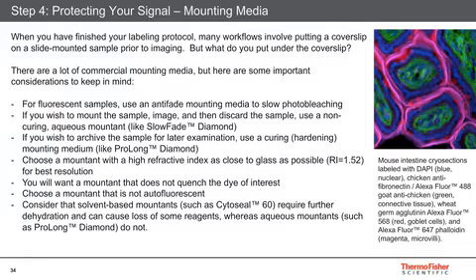When you expose your dyes to a very intense light on the microscope, photobleaching will occur. This is where the dye becomes dimmer as you're looking at it. That's because the strong light is degrading the actual structure of that dye, causing it to not fluoresce as well. An antifade mounting medium has antifade components in it that slow that photobleaching. If you want to mount, image, and then discard your slide, then you want a mountant that has a good refractive index right away, like our SlowFade Diamond and SlowFade Gold products. They don't firm up, they just stay liquid.